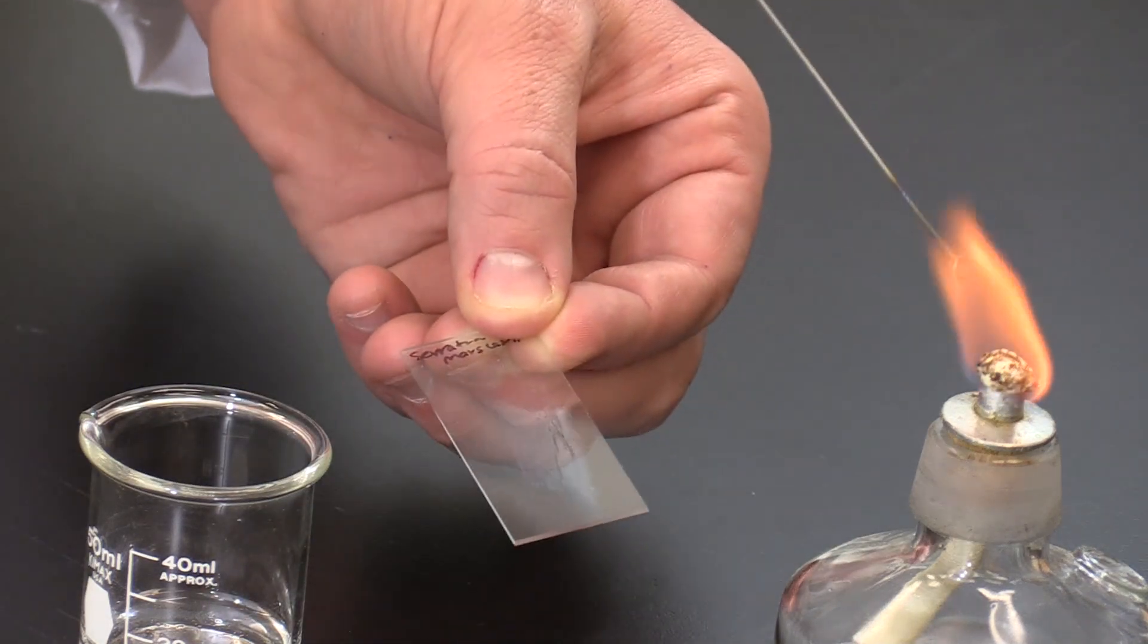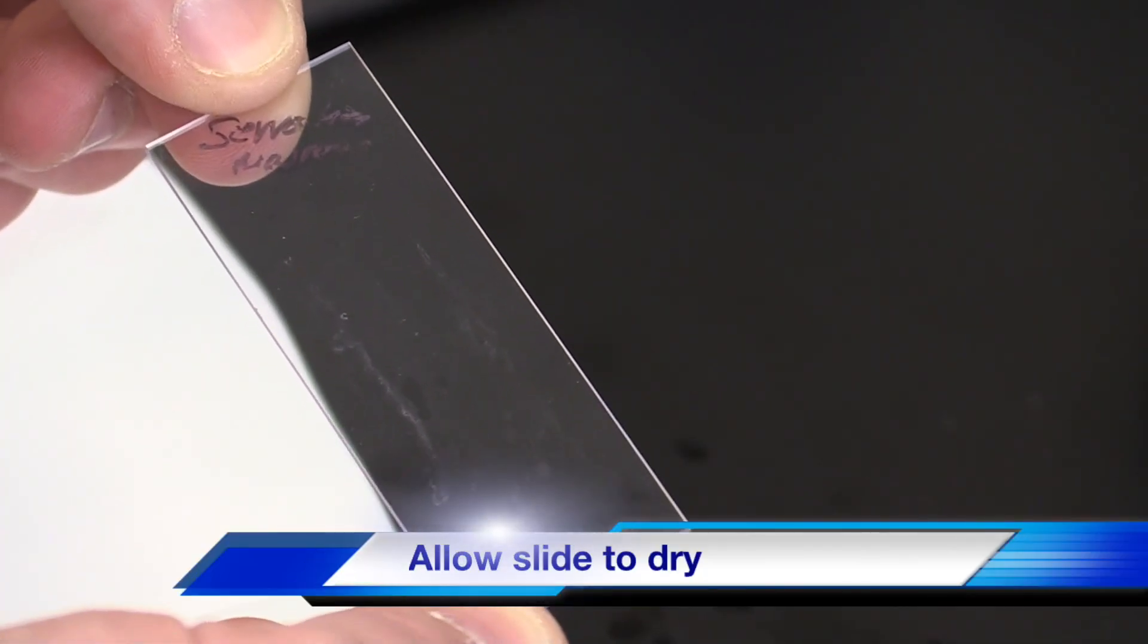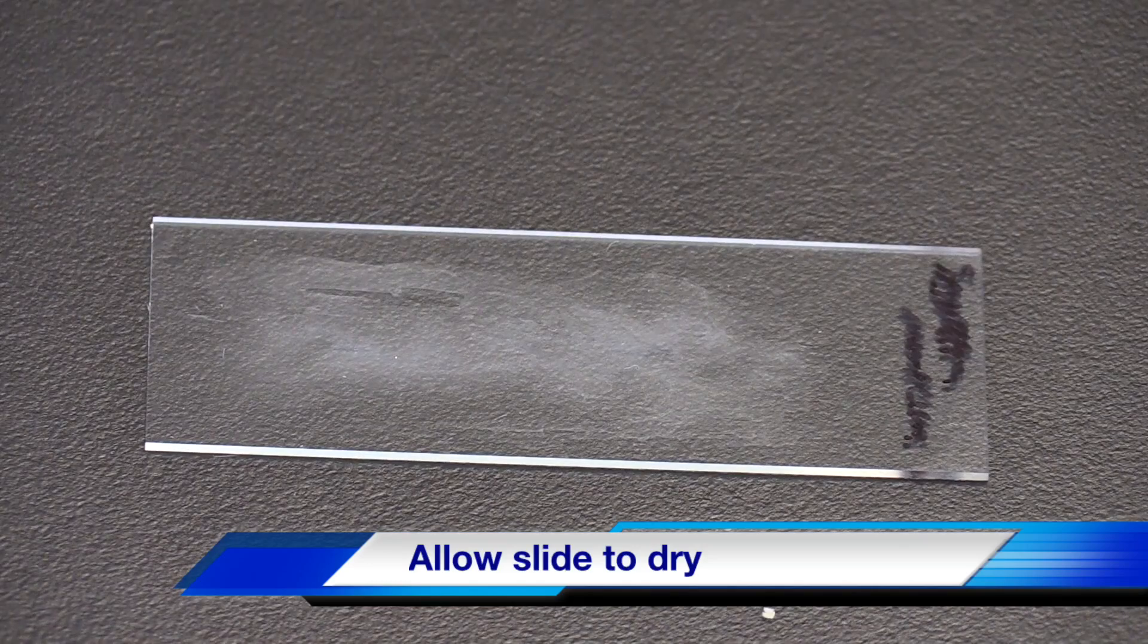After creating the smear, reflame the loop until it glows red. Allow the slide to air dry until it looks hazy with no water droplets.